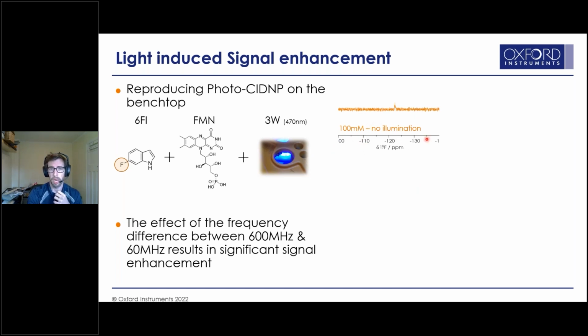And using our 19F NMR with no illumination, we can see a small peak just above our baseline there. Now, this comes from the fact that although we're at a reasonable benchtop concentration, the sample space is a little smaller due to using the tube as the light guide. But we thought, actually, let's push this.